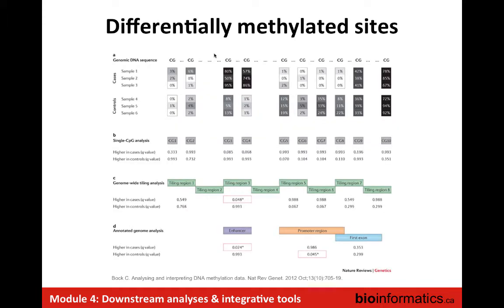Guillaume talked to you about that this morning, but for instance in the case of methylation, we can look at differentially methylated sites across groups, cases versus controls, and then we can look either at specific sites or at groups of sites or CpG islands that seem to behave in similar ways.